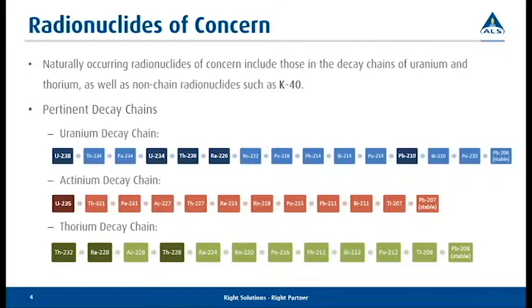So there are different ways of looking at the data. Some people look at it strictly off of the MDC, which is our minimal detectable concentration. So 3 is greater than the MDC of 1, so it's a hit. Some people will then take the uncertainty bar and say, well, 3 minus 2 is 1, which is the same as the detection limit, so is that really a hit or not? That becomes a question. Although if you're doing it that way, it's just as equal to say 3 plus 2 equals 5. So you're somewhere in that range.